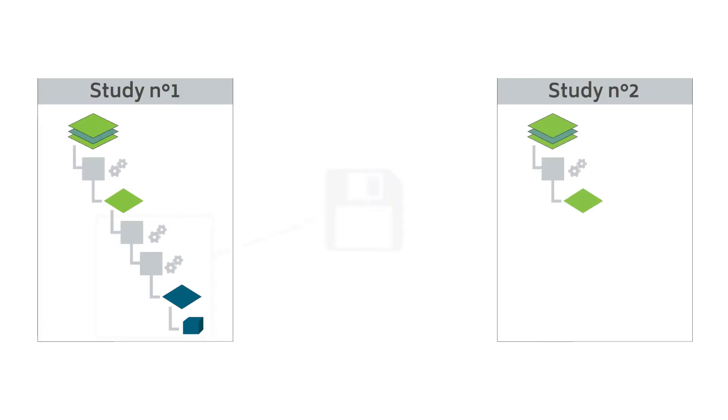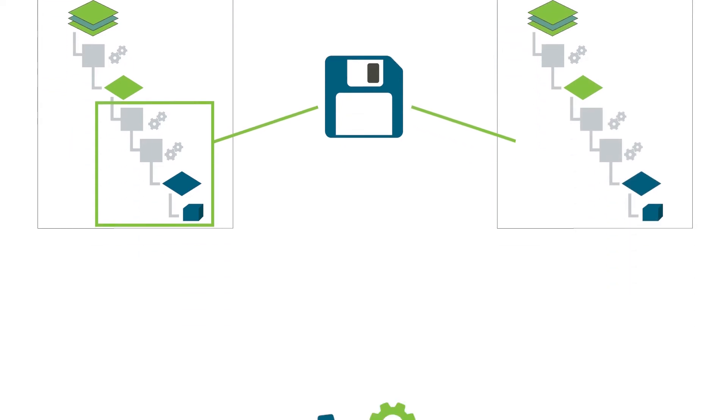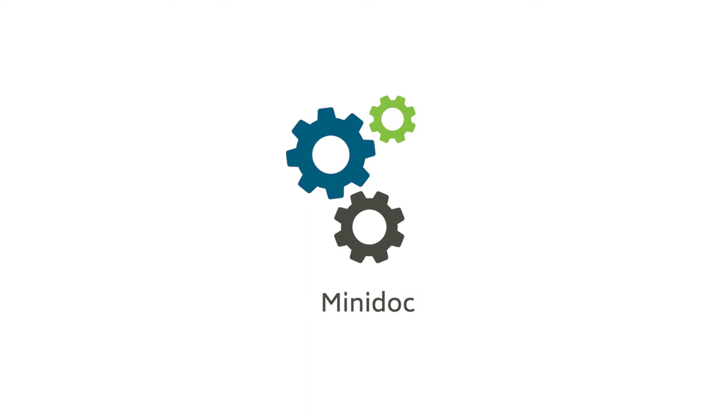You may wish to save a sequence of analysis steps in order to reapply them to another data set at any time. This can be easily achieved thanks to Mountain's mini-doc feature.